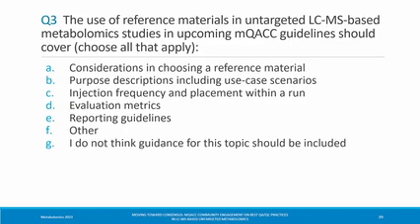All right, one more response on this question, yes. Okay, that's great. To add to that, when you're doing really large studies with thousands of samples, it's really important to plan very meticulously in terms of your pool QC, because you want it to last for a very long time. So when you're talking to a consortium or planning how those samples are collected, make sure there's enough not only for your sample extraction, but to pool those samples, and have a really good plan for that ahead of time.